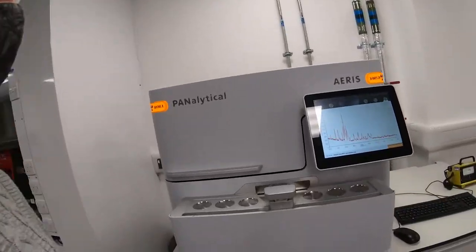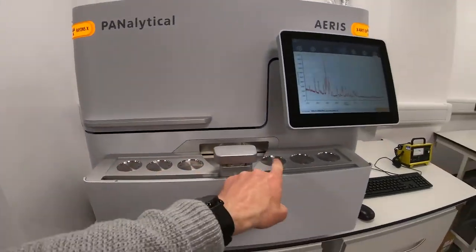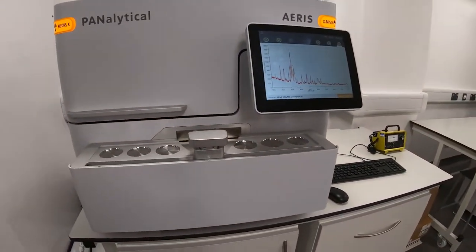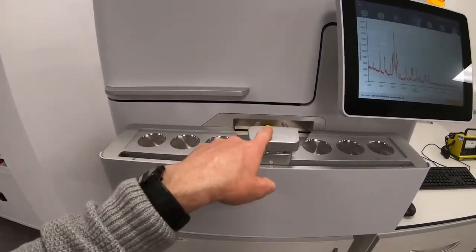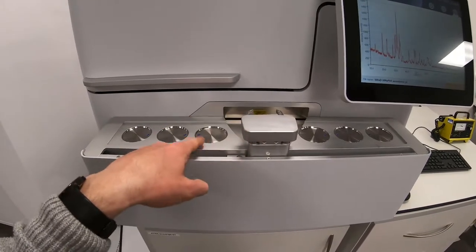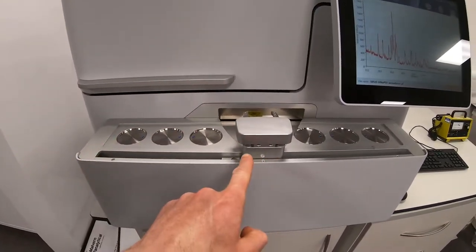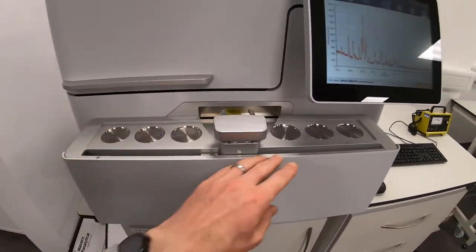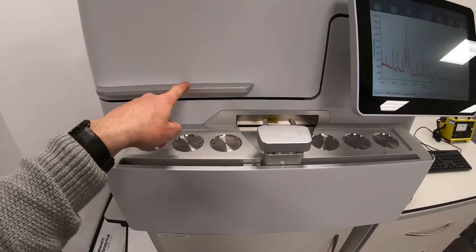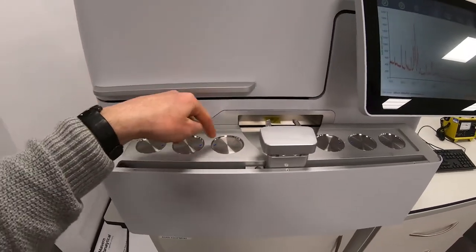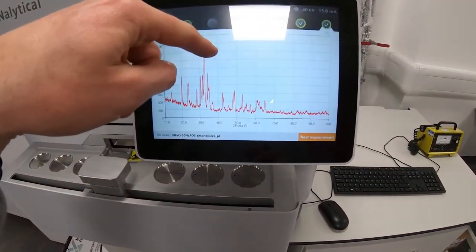There are six positions in the sample changer: one, two, three, four, five, six. The main risk with this instrument is that the auto changer picks up the samples, so when it's in motion you shouldn't be putting your hands in here and you should never lift the door open at all. All your access will be through putting samples on here and through the touch screen.